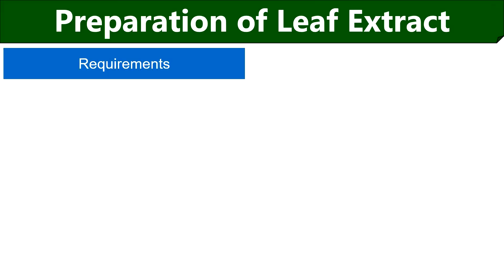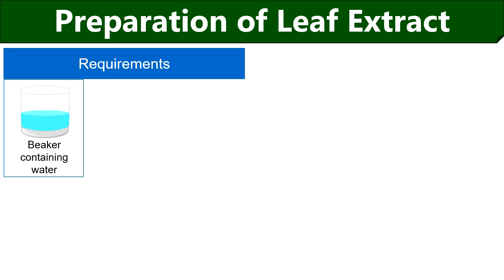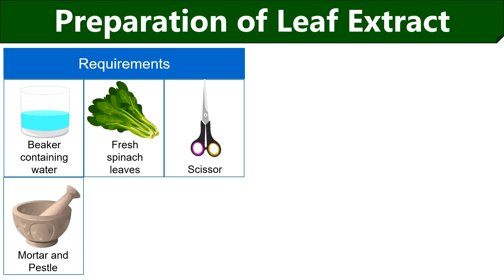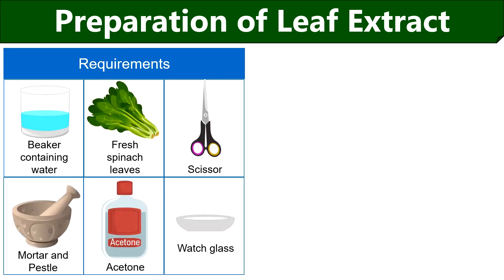For the separation of plant pigments, first we have to prepare a concentrated leaf extract, for which we need a beaker containing water, fresh spinach leaves, scissor, mortar and pestle, acetone and watch glass.